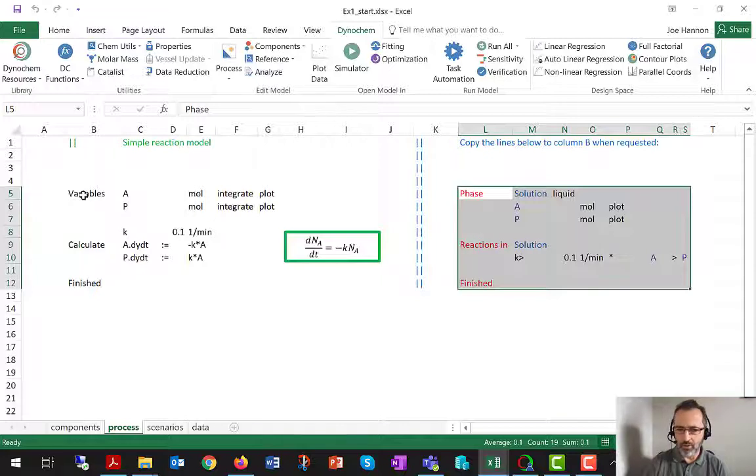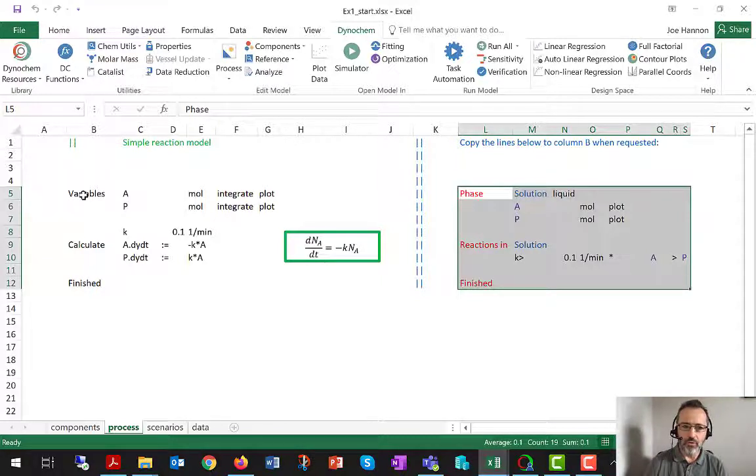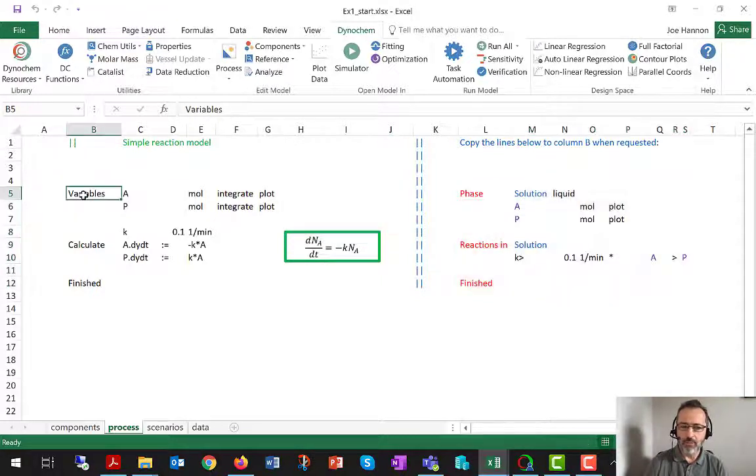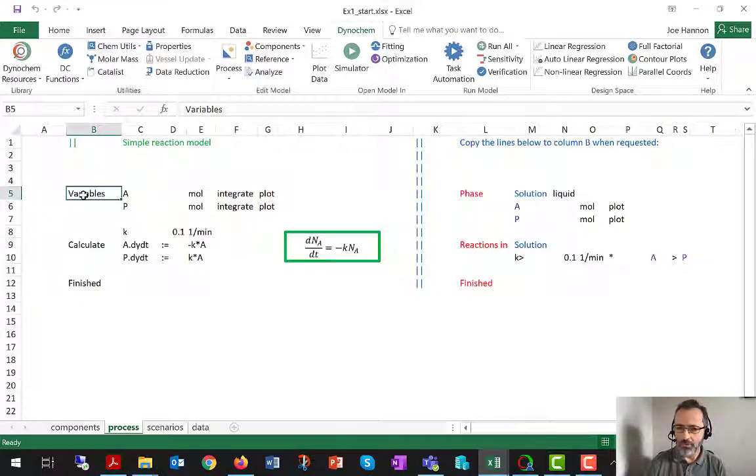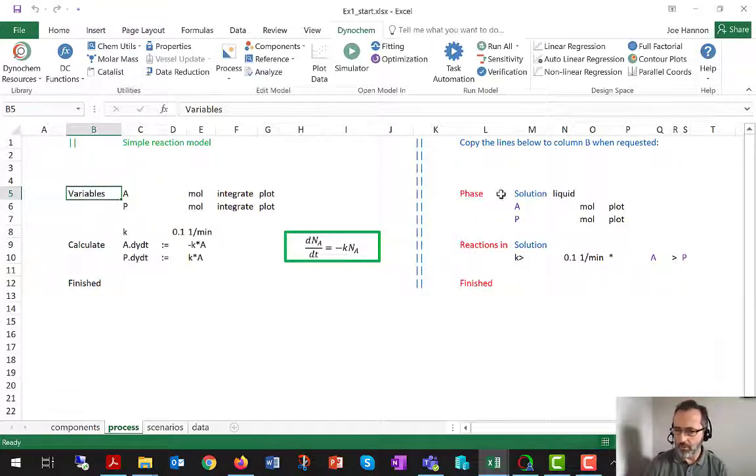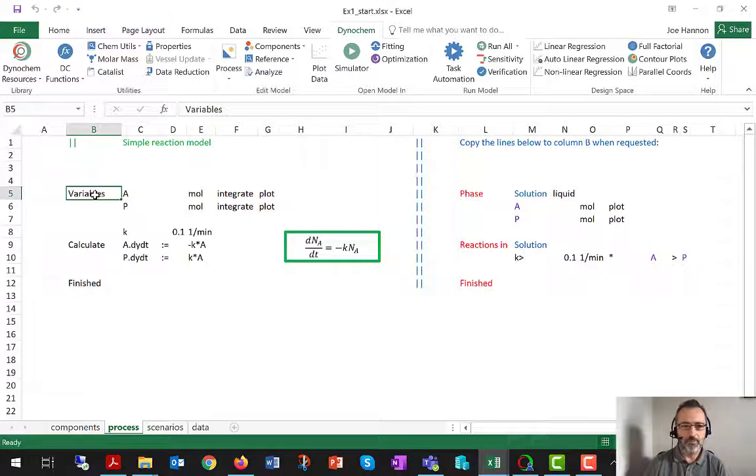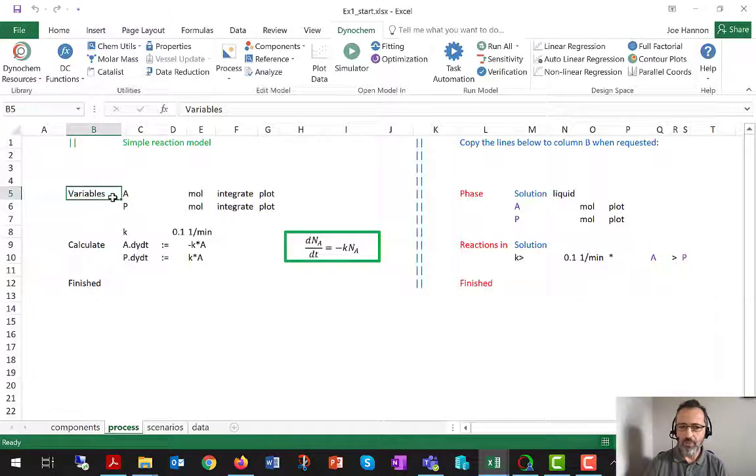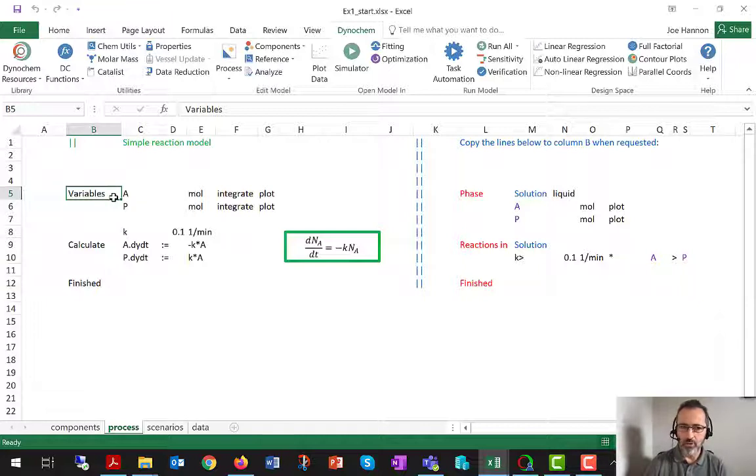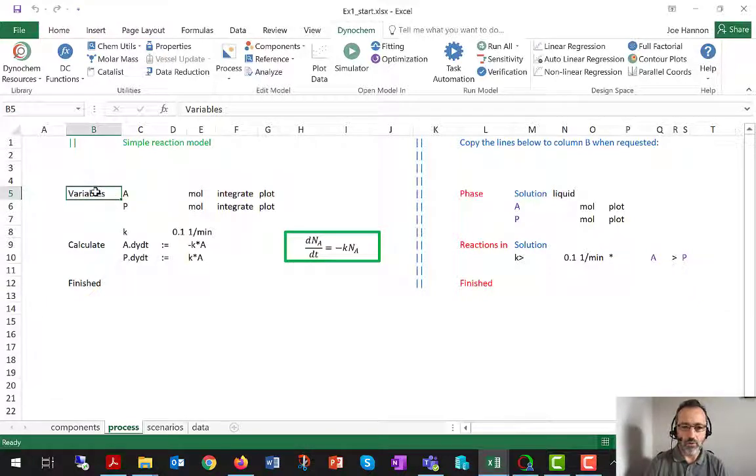you may find situations where it will be your preference to declare all of your variables rather than using phases and rates. Instead, to write a list of all of your variables and write your own hand-coded ODEs or other equations for those variables.